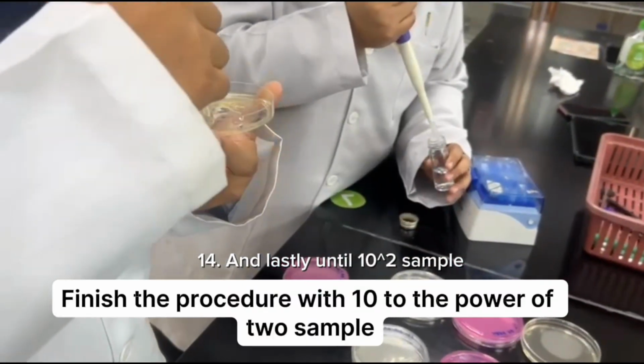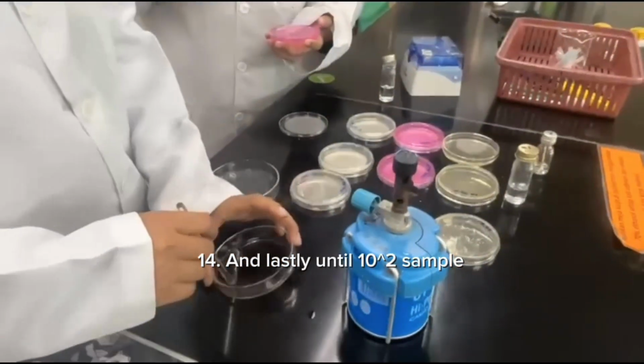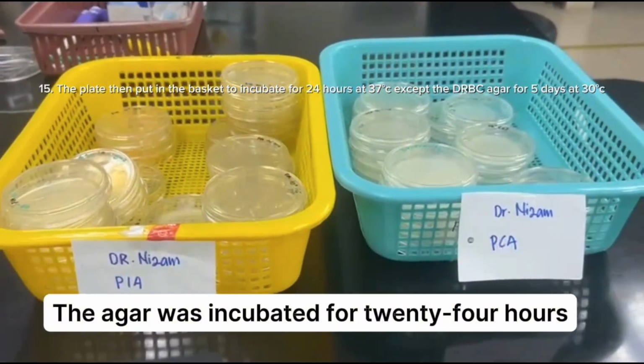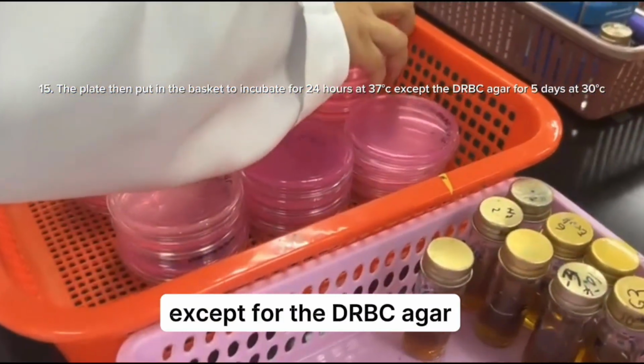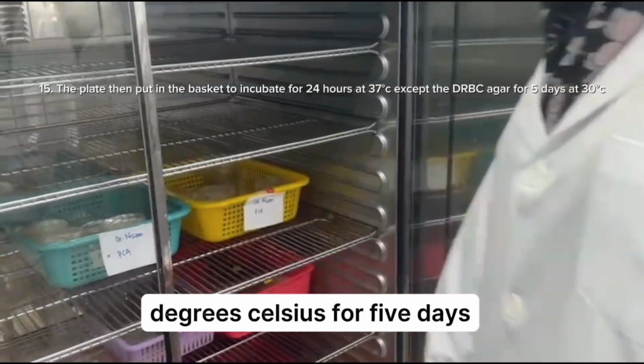Finish the procedure with the 10 to the power of 2 sample. The agar was incubated for 24 hours at 37 degrees Celsius, except for the DRBC agar, which was placed in a location with a temperature of 30 degrees Celsius for 5 days.